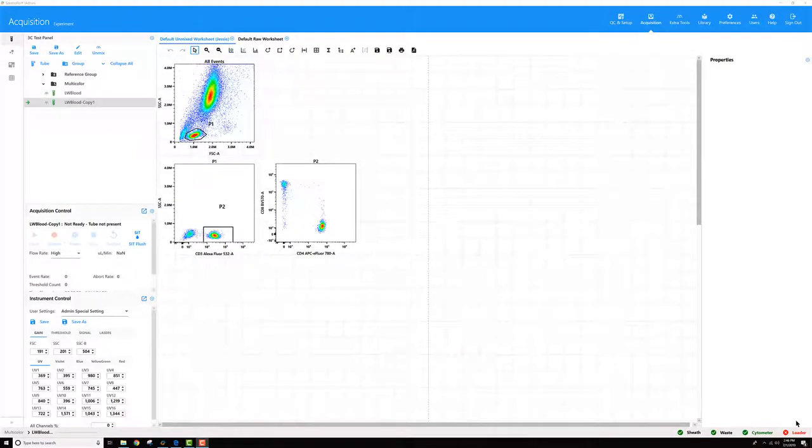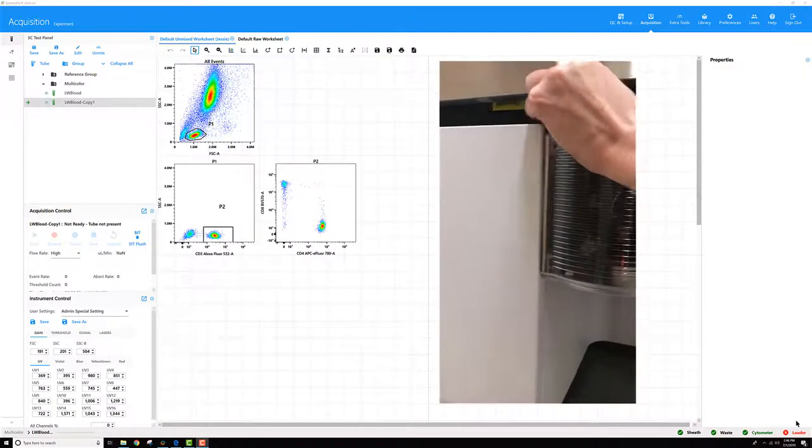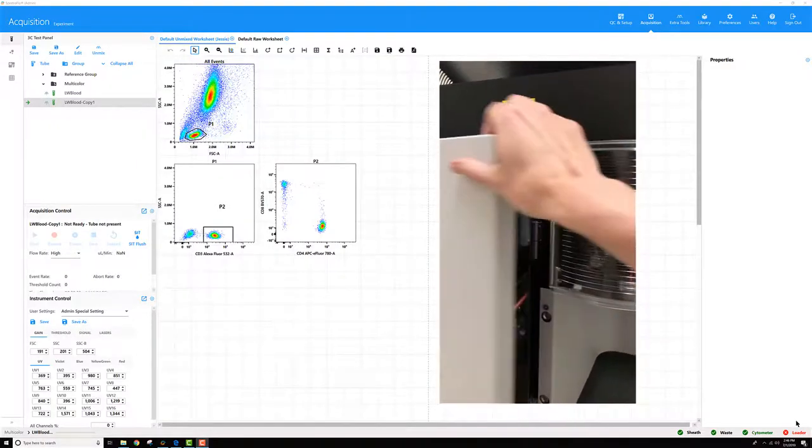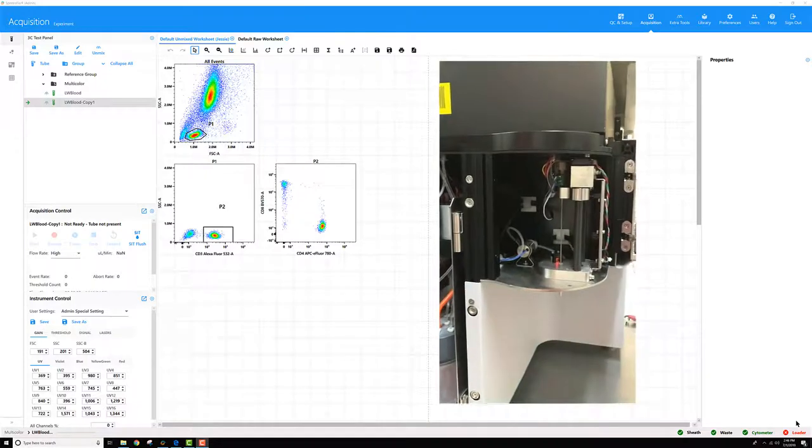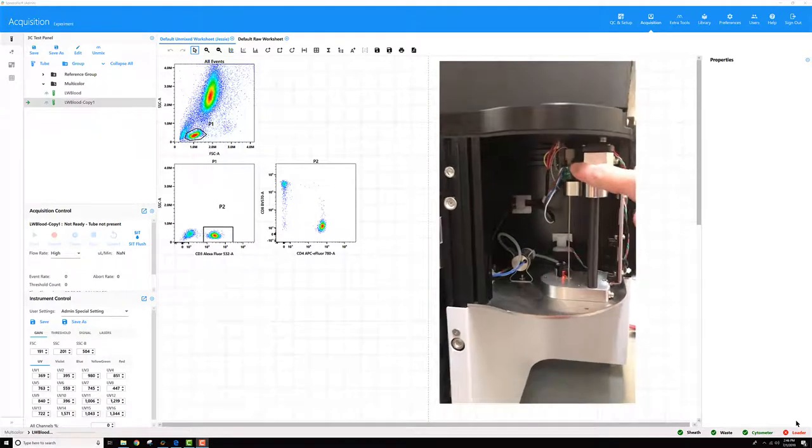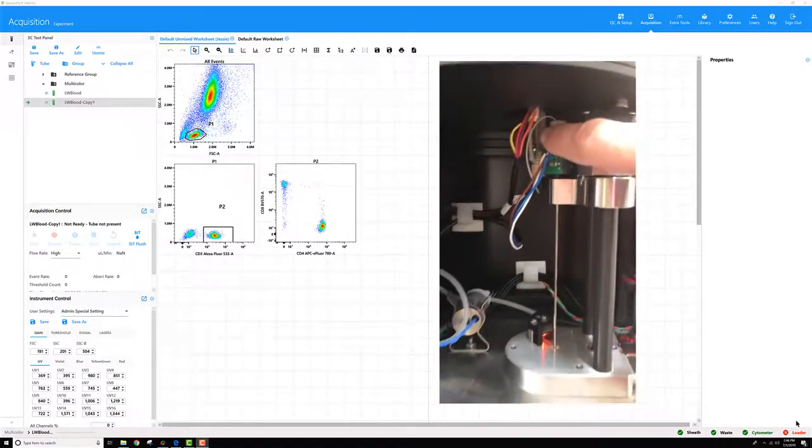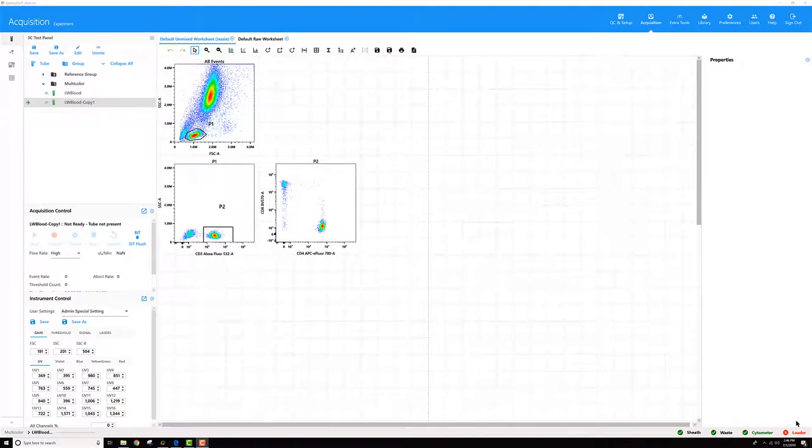On every Aurora and Northern Lights cytometer, inside the sample line door, you'll see there's a flow meter installed. The software is able to use this flow meter to calculate the amount of sample that's recorded during each acquisition.